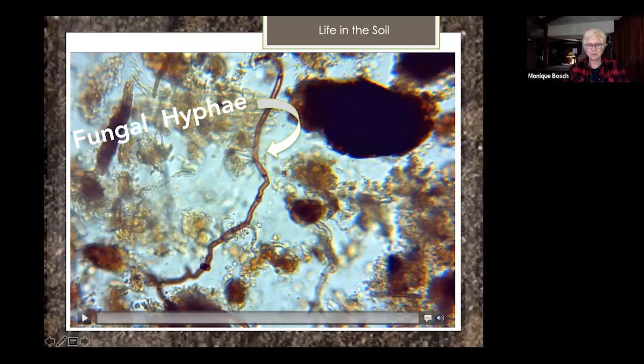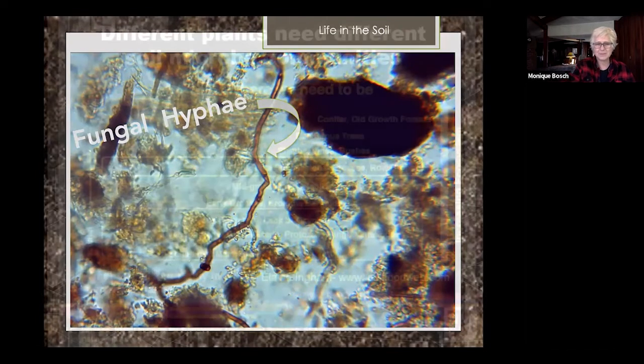So here's another beautiful strand of fungal hyphae. And right along. Come on, there you go.